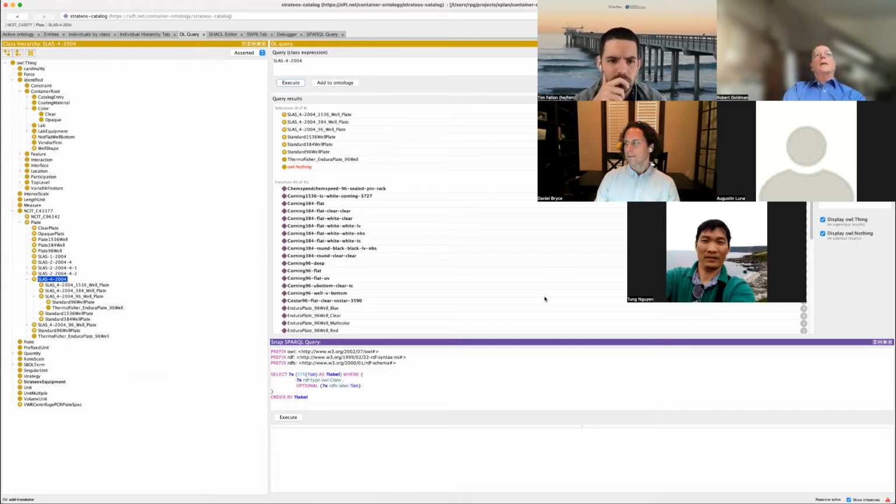So you can say, I don't care if it's 96, 384 or 1536. That depends on how I want to scale this and what my lab equipment is capable of manipulating. The important thing is just that I know how to address the wells in the plate. It has to be standard. Or, like I said, it might have to be clear.